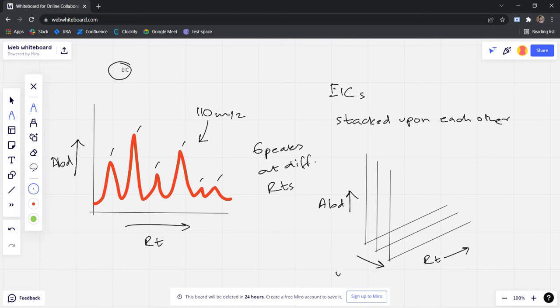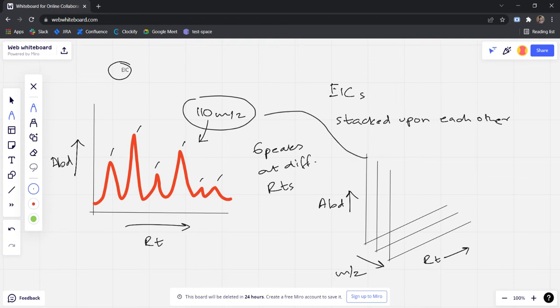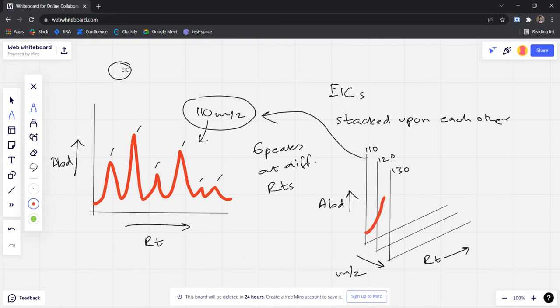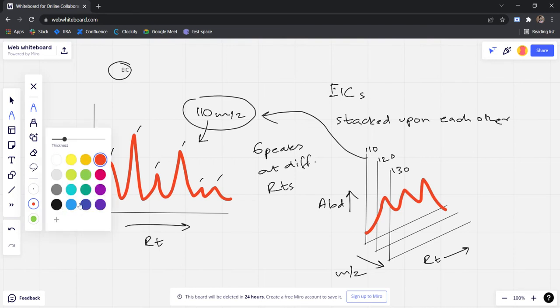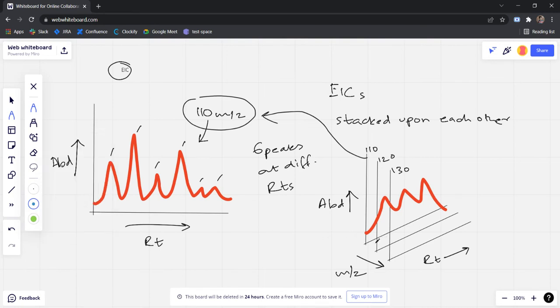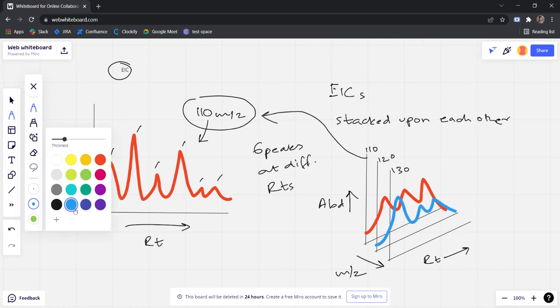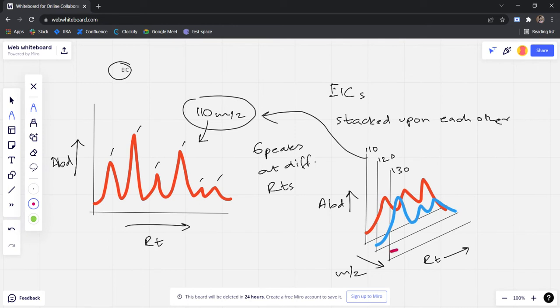Now the third dimension here is m/z. This one is just one of these. So this is at 110, this is at 120, this is at 130, and all of these have different peak information. For 120 this is at something like this, for 130 it is something like this, just two small peaks.